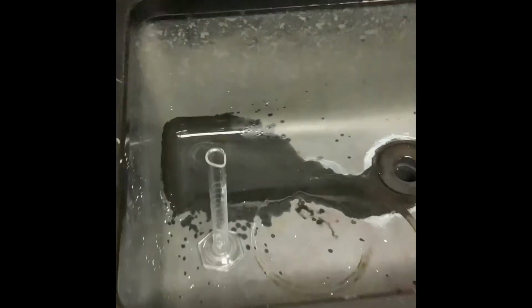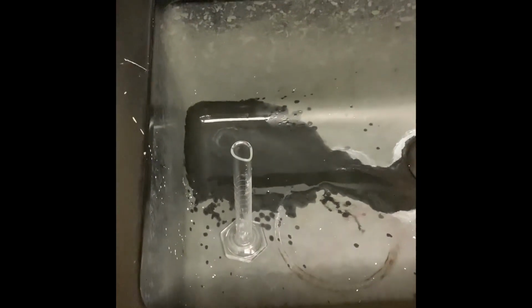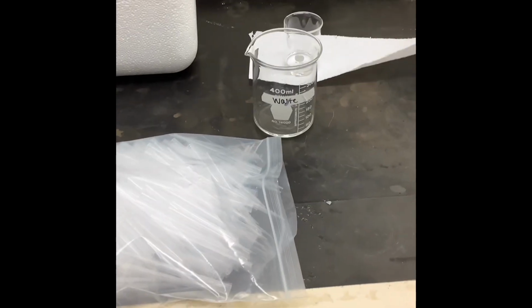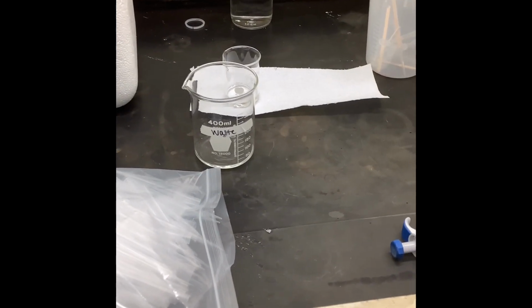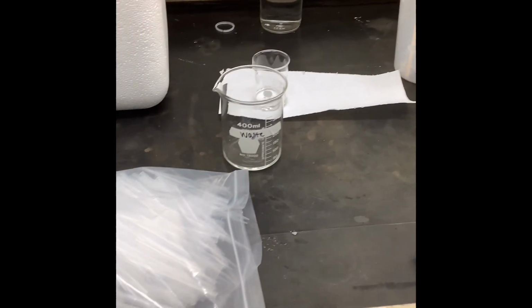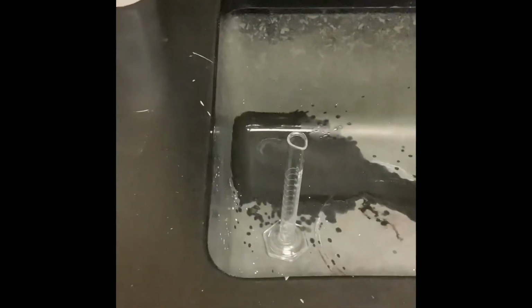One more thing I wanted to mention, so the graduated cylinder that we used for the acetolysis mixture, as soon as the mixture was out, I poured the remaining mixture into the waste jar. I then rinsed out the cylinder carefully with the sodium bicarbonate solution, and I also put that in the waste beaker, and then I added a little bit more sodium bicarbonate to the waste beaker just to neutralize any remaining acids. And then I set the graduated cylinder in the sink. We're going to accumulate a few more dishes over this process, and then we'll wash them all at the end.